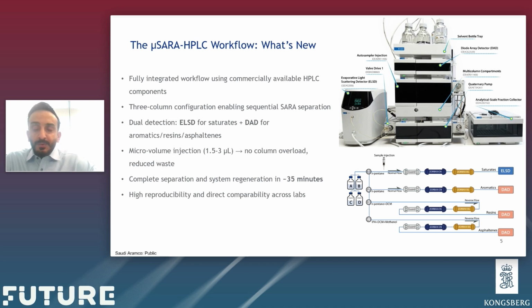Now, the micro SARA-HPLC workflow that we're introducing here, I'll walk you through what's new. What you see in the picture at the top is the actual system that we have built in our lab. Our goal was to design a system that anyone can deploy. There are no custom columns, no specialized hardware, and no off-lab modifications.